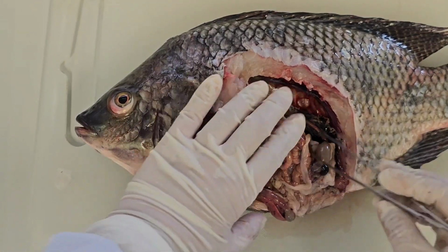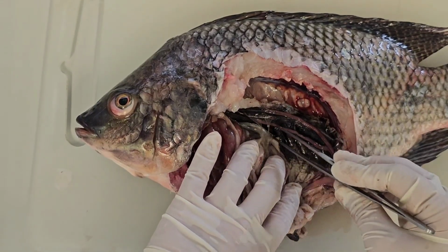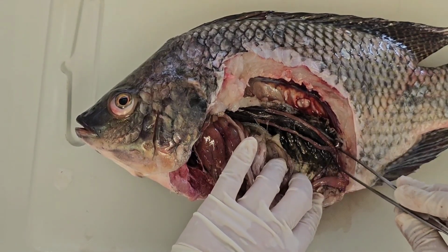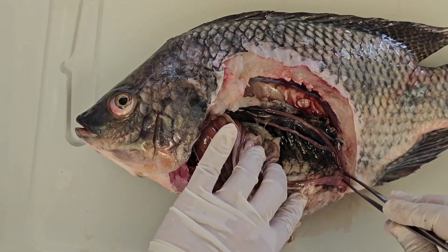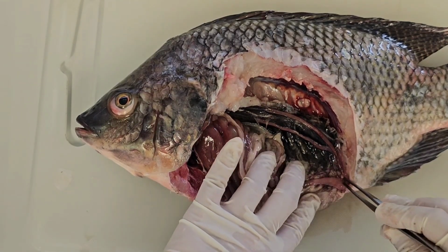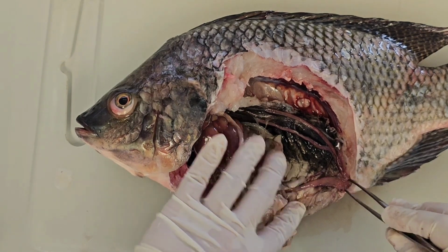Okay, and then what else? From here you can see the two lines. So this one is the gonad of the male and female reproductive system. They will produce the egg and sperm, which go to the urogenital orifice there.